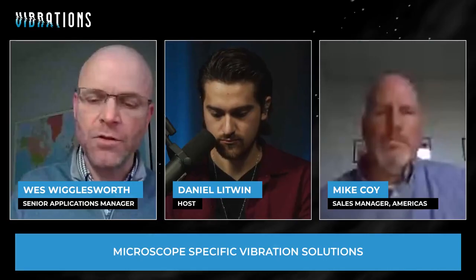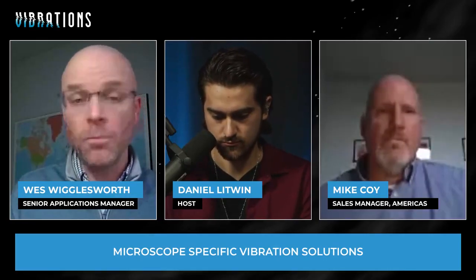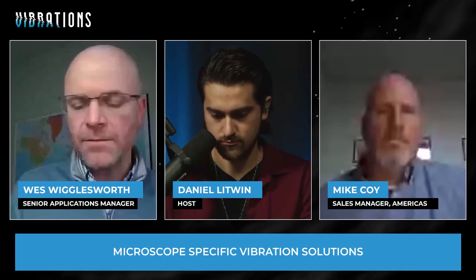The challenges I mentioned earlier are almost always there. It's how do I measure at very low frequencies and get really what I need in that 1 hertz to 5 hertz range, which is so critical for the microscope and so prevalent in building vibration. I would say that's a big one.